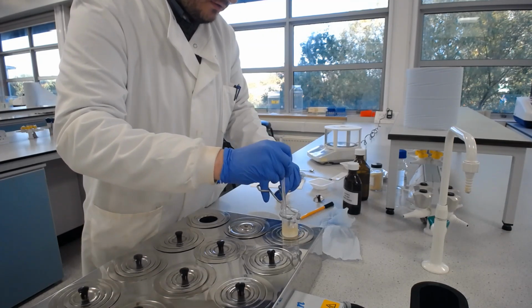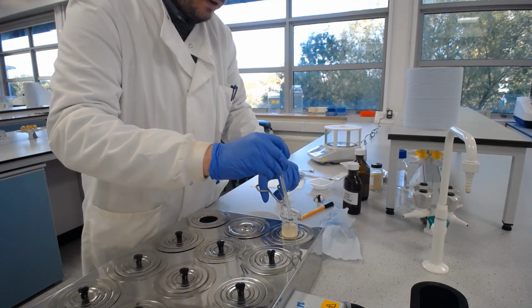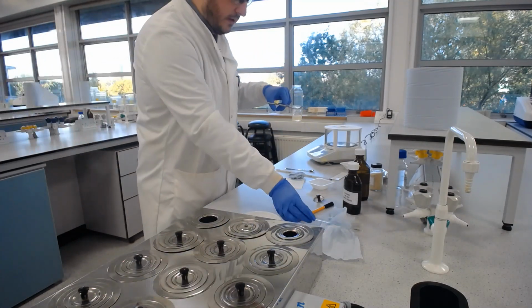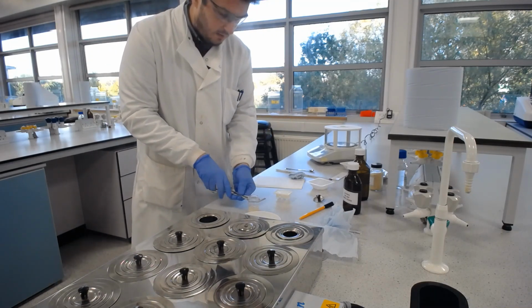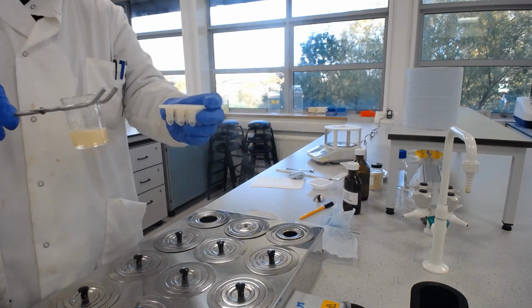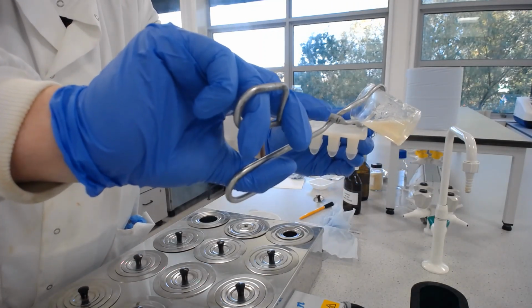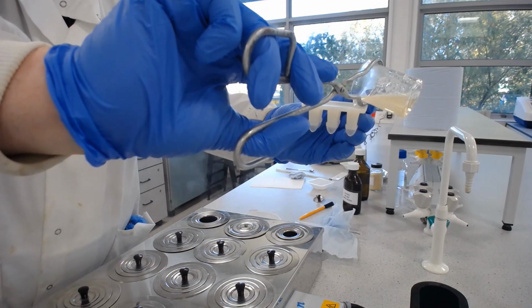If you didn't have an excess of water at this point, you would probably need to do this slightly quicker, but I've still got a little bit of excess, so I'm just being a bit more cautious. Okay, so there we have our mixture, which we can pour into our moulds. Remember that glass is probably going to be quite hot still, and you'd want to do this on a flat surface, but I'm going to come over here so you can see what I'm doing. You definitely would want to do this on a flat surface. So I'm just going to pour that directly into these moulds.